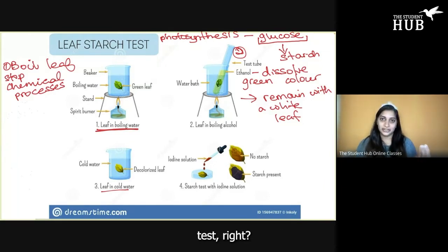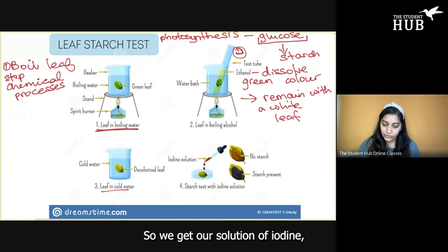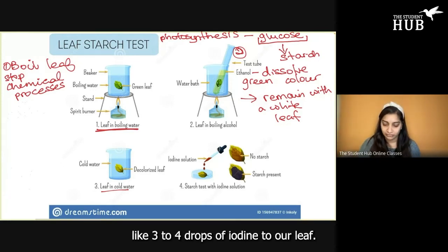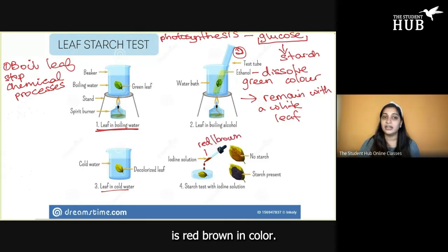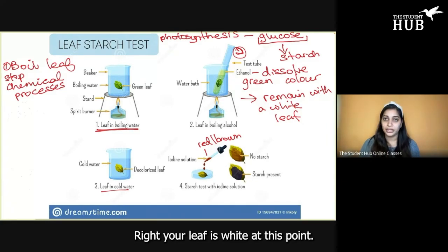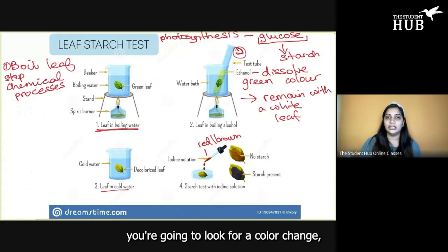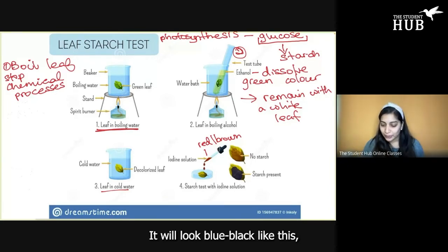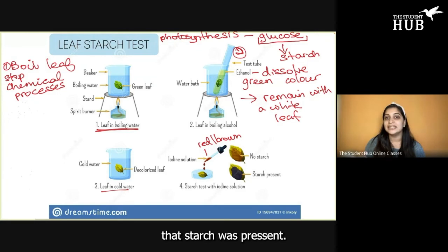After washing, we can do our starch test. We have a white leaf, and we want to see if it is going to react with iodine. We get our iodine solution — add about three to four drops to the leaf. Remember, the iodine solution is red-brown in color and your leaf is white at this point. You're going to look for a color change. If starch is present, the only color change you'll see is your leaf turning blue-black, like what you're seeing in this image here. If it turns blue-black, that means starch was present.